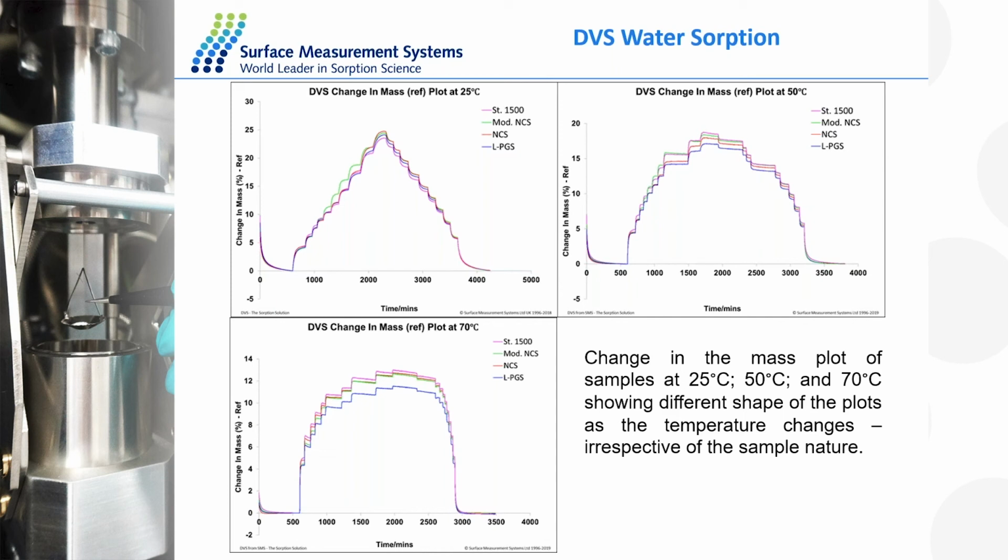The experiments we mentioned here are not to do with surface energy, they're to do with surface area. In this case, when we introduce humidity, the water interacts with the bulk of the material, causing it to swell, so we have an increase in surface area. However, in some samples, this is not necessarily the case.